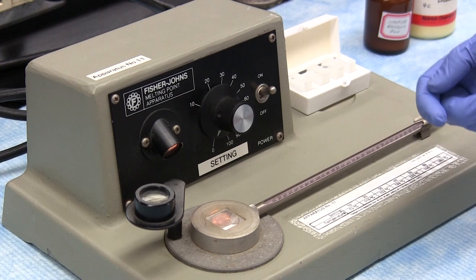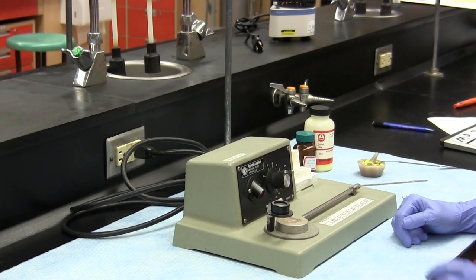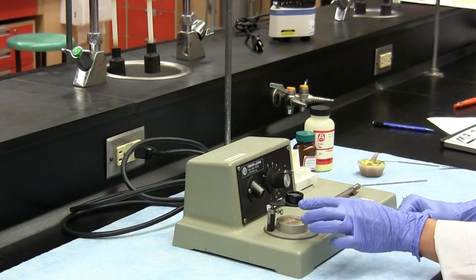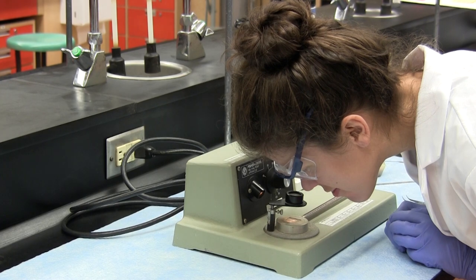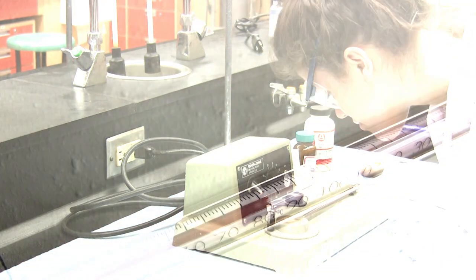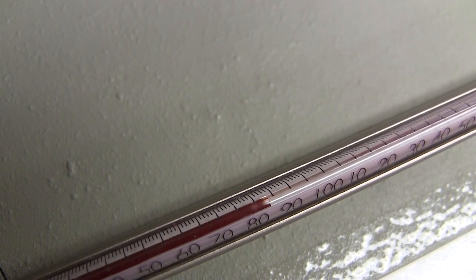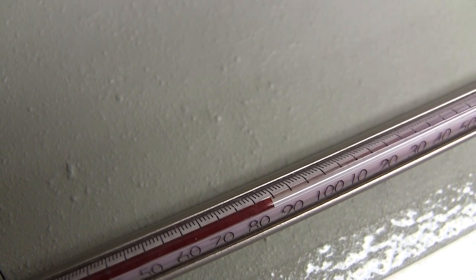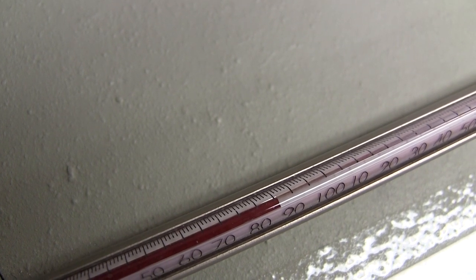The temperature regulator is set to the maximum. This allows the block and sample to heat up rapidly. The magnifier can be used to monitor the crystals of solid as they are heated. The temperature is monitored using the thermometer. When the temperature reaches about 15 to 20 degrees below the expected melting point for that substance, the rate of heating should be lowered to no more than 2 degrees per minute.